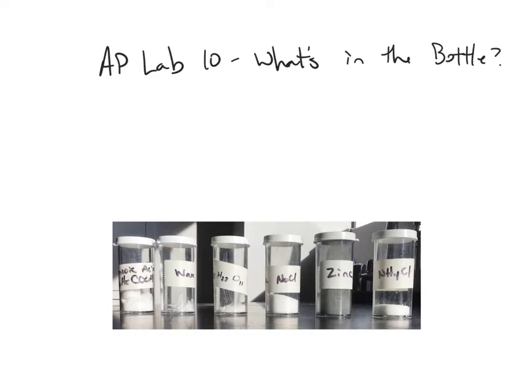Hey everybody, this video lesson is going to cover the Prelab for number 10, What's in the Bottle. In the past there's been a little bit of confusion about how the process is supposed to go in what order, and so I'm hopefully going to try and iron that out here before we start so you don't waste your time.